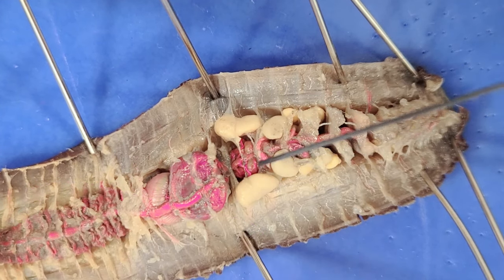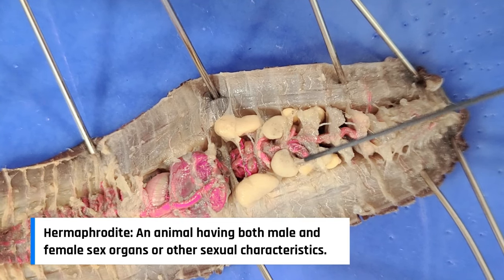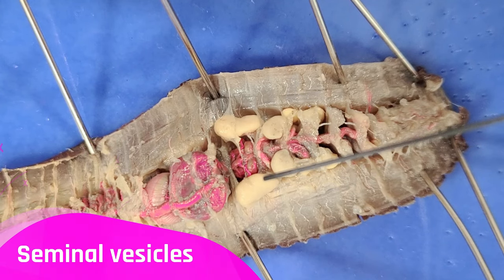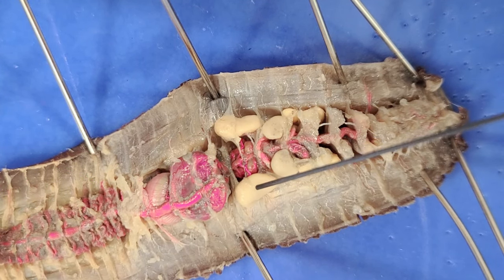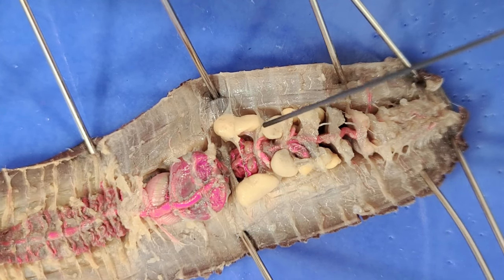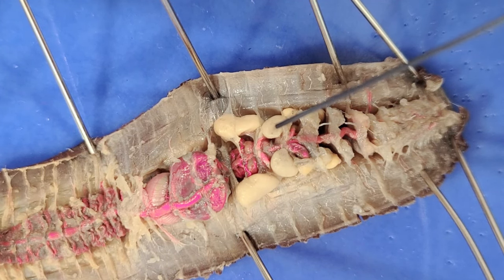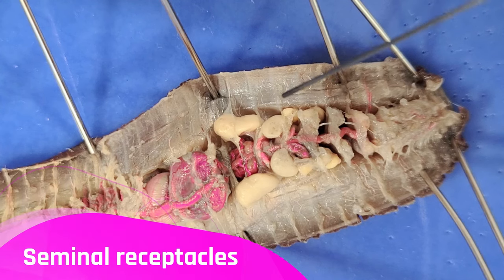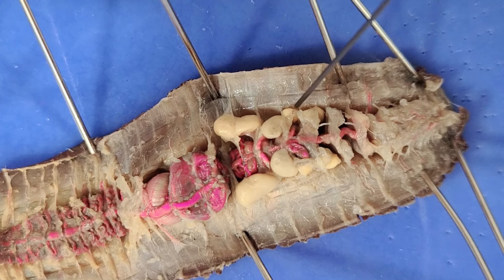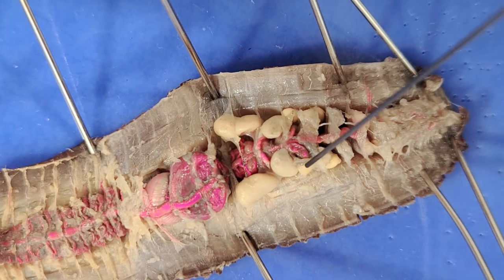Down here are the reproductive organs — these yellow things. Worms are hermaphrodites, which means that they have both male and female reproductive organs. The male organs are the seminal vesicles, which produce sperm — these large structures here, here, here, and here. The female organs are the seminal receptacles, which receive sperm. These are the smaller structures — right here, here, here, and here.